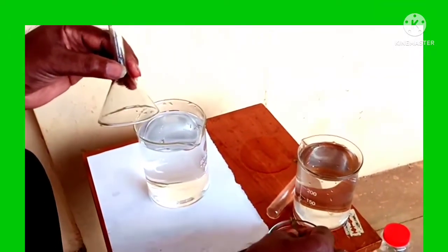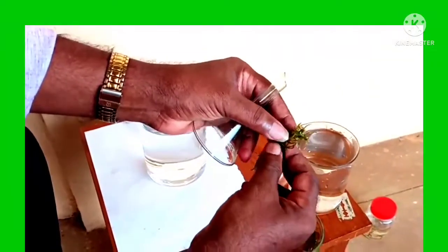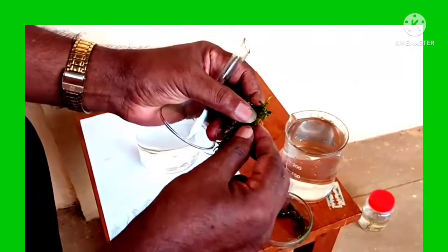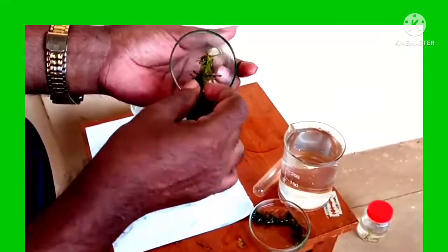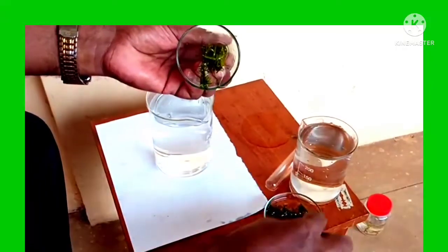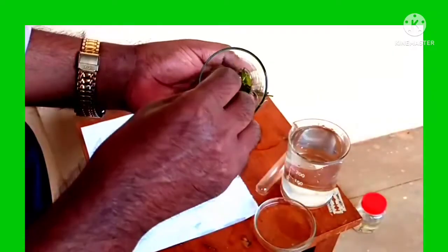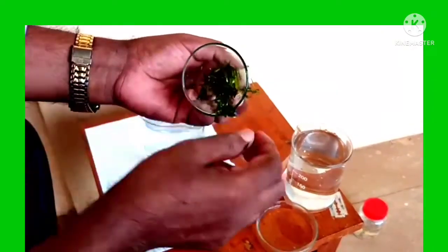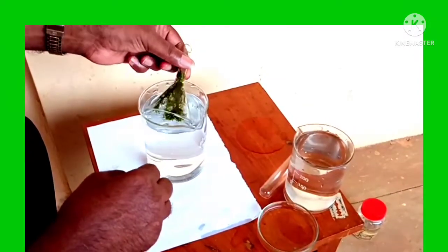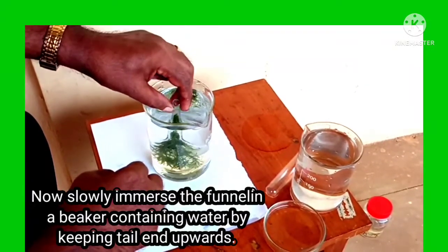Collect all the pieces together and fix the cut ends of the plant twigs inside the neck part of the glass funnel. The cut ends of the plant should be fitted tightly into the neck of the funnel. Then slowly immerse the funnel in a beaker containing water, keeping the tail end upwards.